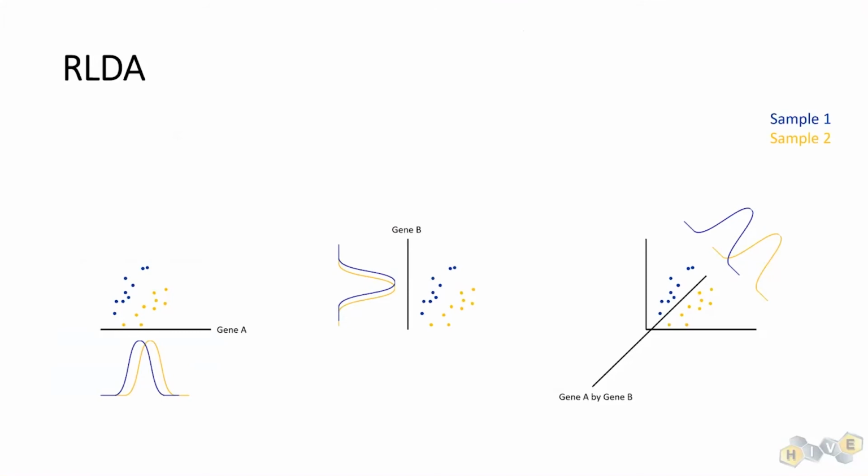And just like PCA, it does that by trying to find a perspective on the data. So let's say you have two data sets, and let's say they look like this in space. They're both going to probably end up showing you some perspective on your data that looks like this, if they're already separated like this.